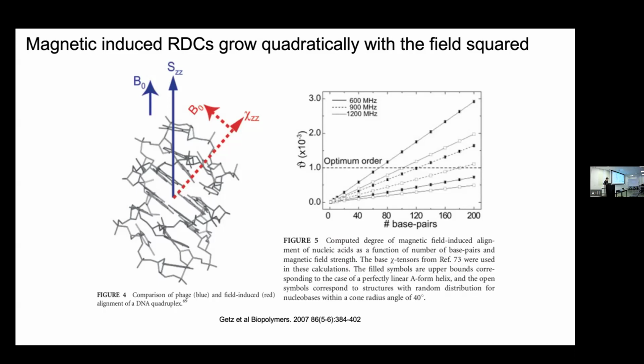DNA in the lab today, which we could, you can synthesize an oligonucleotide 60 base pairs long, 60 nucleotides. Right? So let's say you make 60 nucleotide DNA and you label one position because we can do it, to get rid of spectral crowding. Actually, this is a great experiment. We should do this experiment. If you just label the middle, one residue, and then you make the partner oligonucleotide, the complementary nucleotide, and then you anneal them, and you take said sample and send it to Ohio, to the 1.2 gigahertz NMR spectrometer.